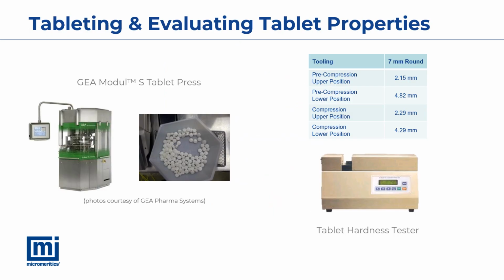Of course, all of this hinges on there being a good correlation between the BFE and tablet hardness. So let's take a look at those results next. The tablets were produced in a common tablet press and then measured in a common tablet hardness tester.